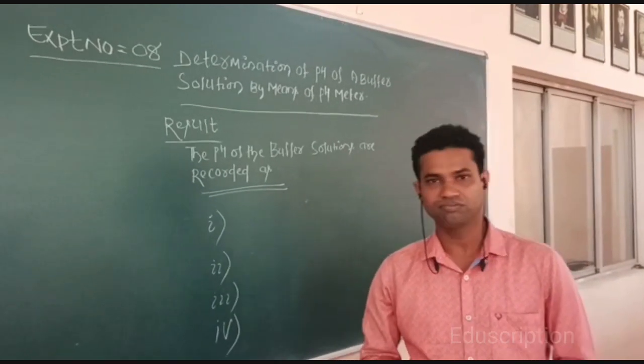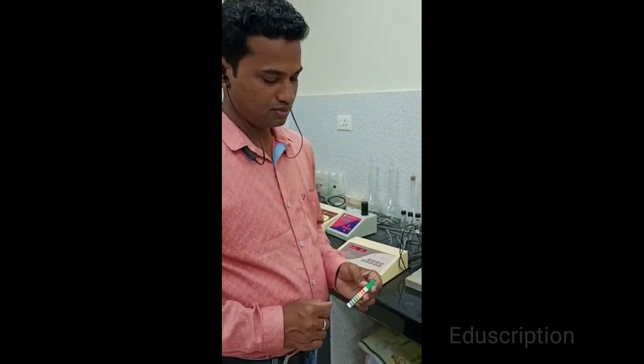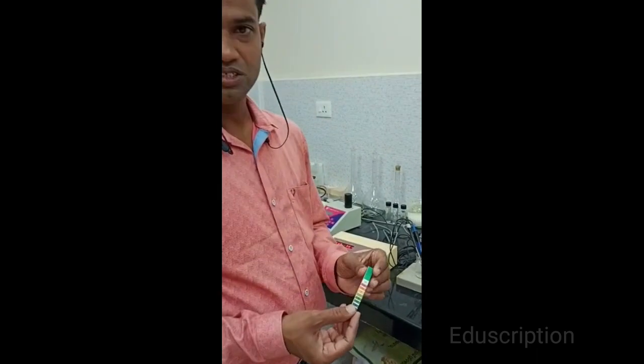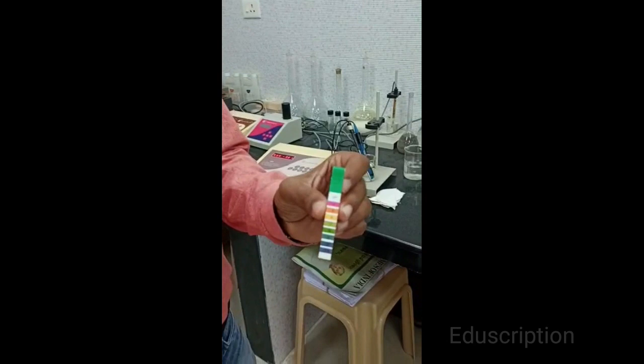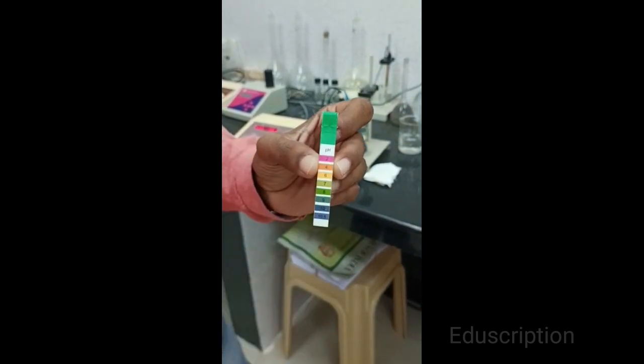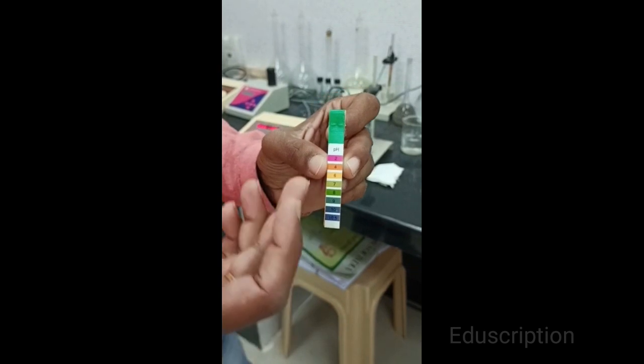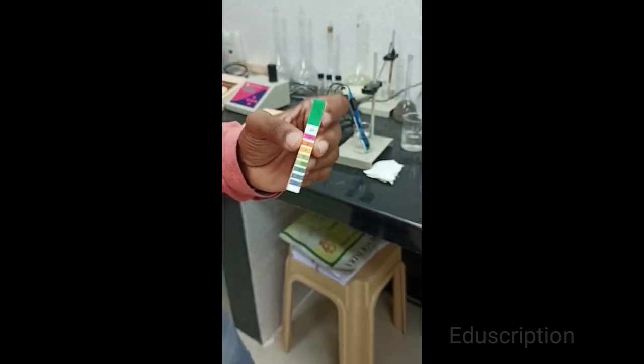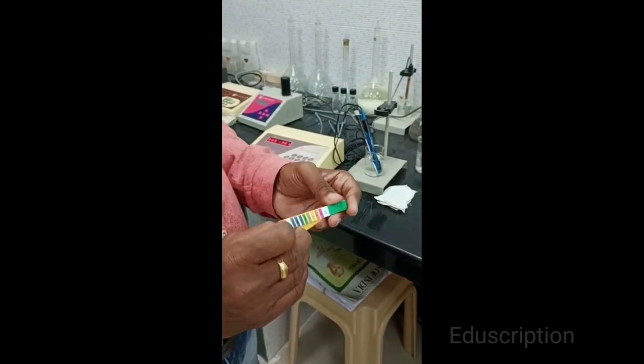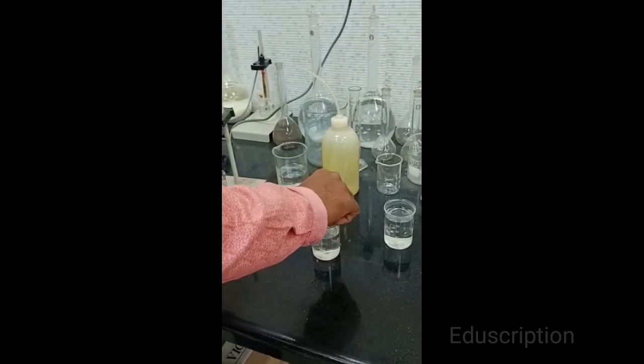Now we will go for detection of pH value. I will show you one example of colorimetric method. This is pH paper. It gives detail of color: pH 2 this color, pH 4 this color, pH 6 this color, all details are given.